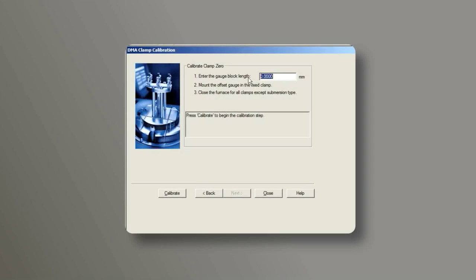From the control software, enter the length of the offset gauge. Then click on Calibrate.